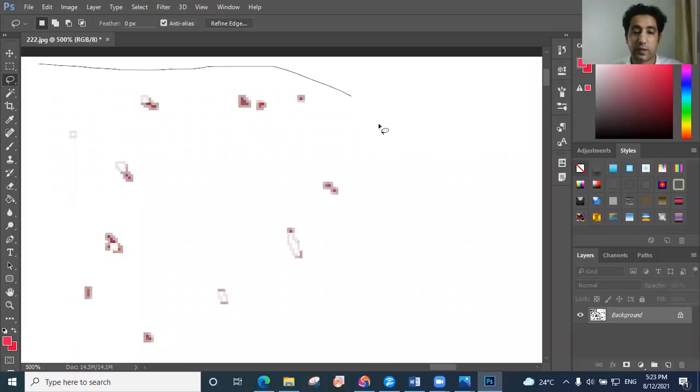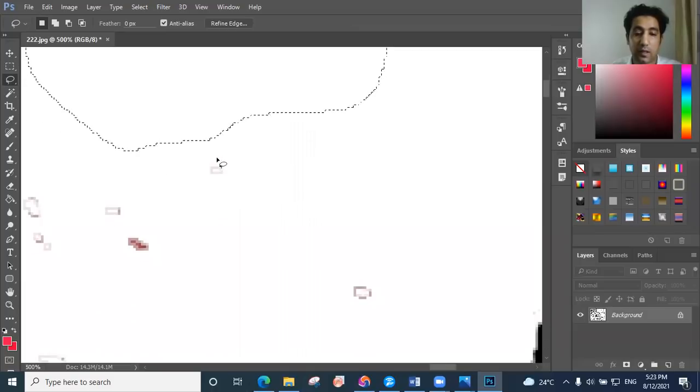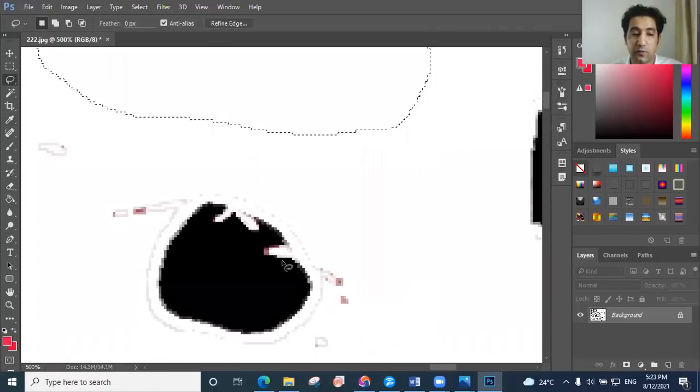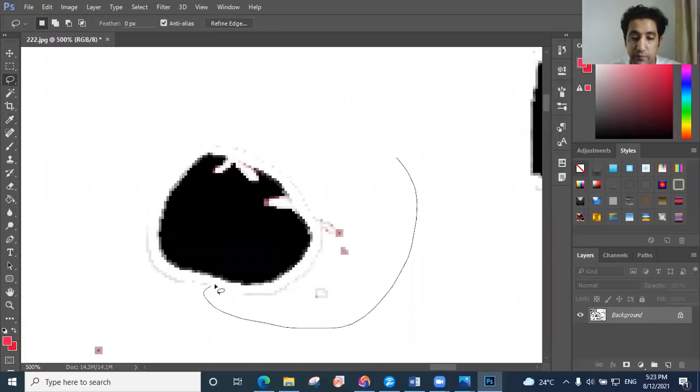All right, just here, click, circle, and then delete, then okay. And delete and okay. Just move on, and you go up till you pass all the picture. You see this.